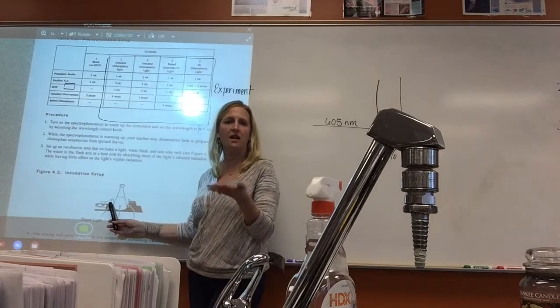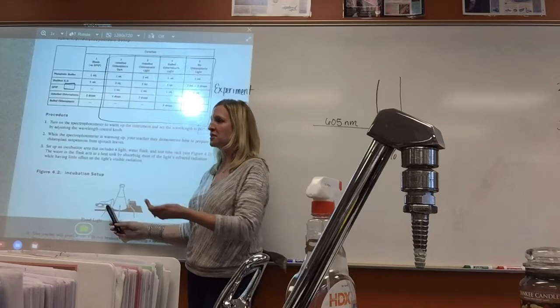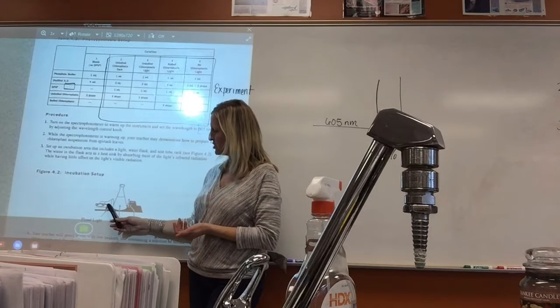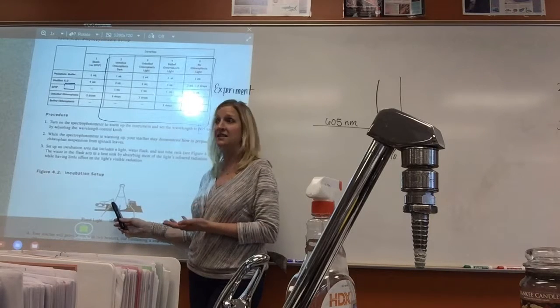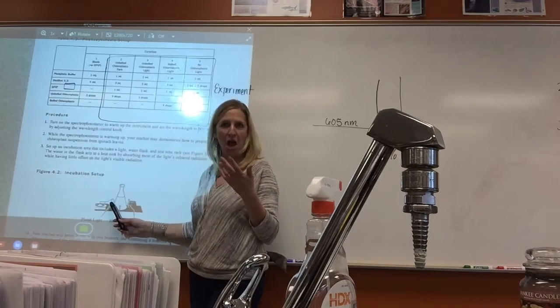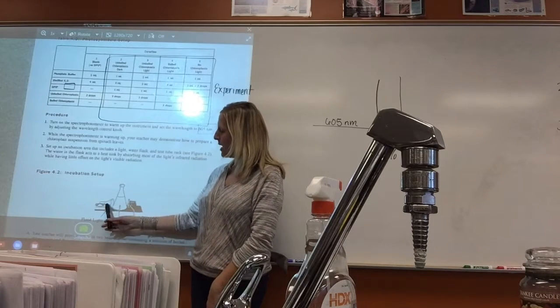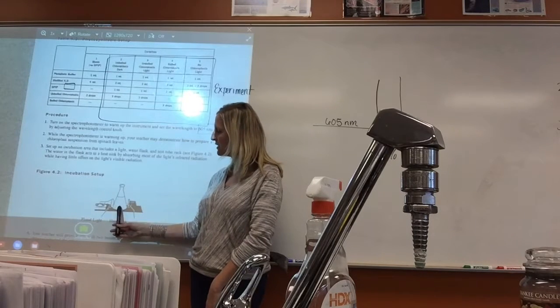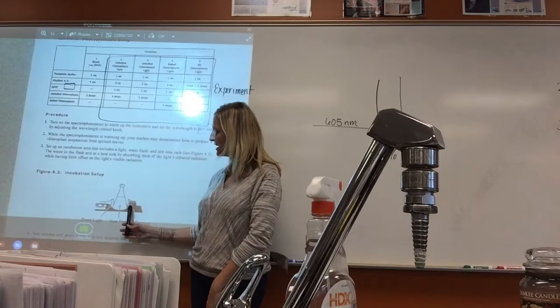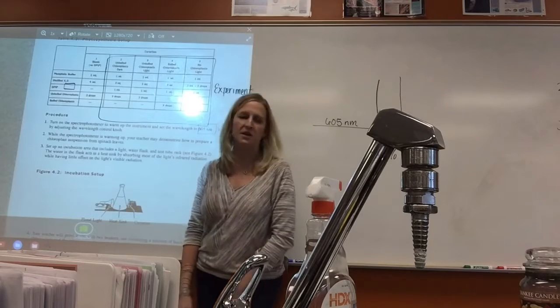Our electricity, our lamps and everything electric basically is not 100% efficient. So the electricity that the lamp is using, some of that energy gets converted to the actual light, but a lot is lost as heat, increasing the entropy of the universe. And so this heat sink absorbs the infrared or heat energy and allows the light to still be transmitted, so these guys are still getting the light, but the heat is not going to cook the chloroplast. So it absorbs the heat.